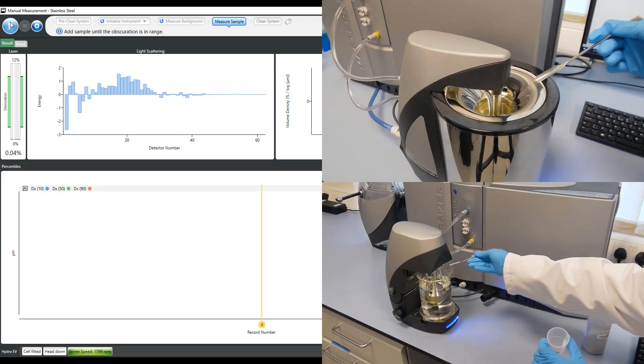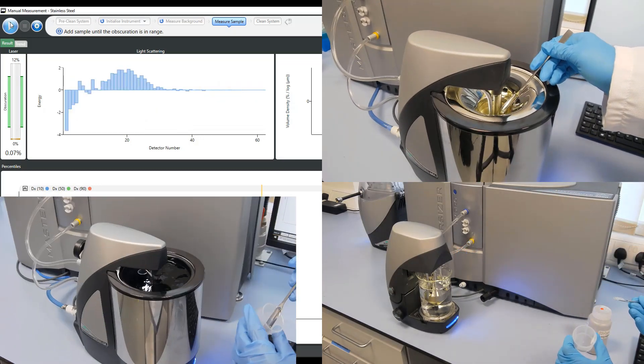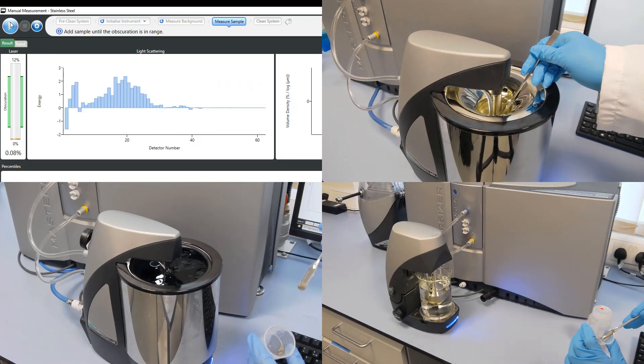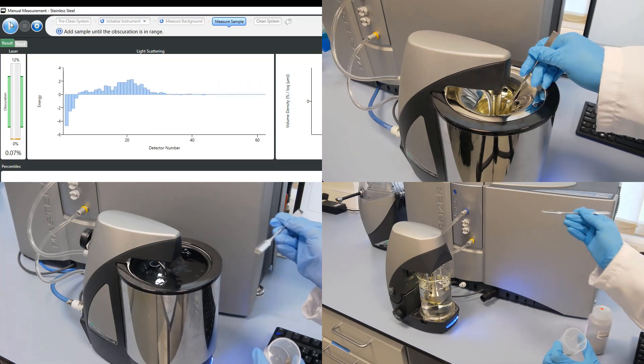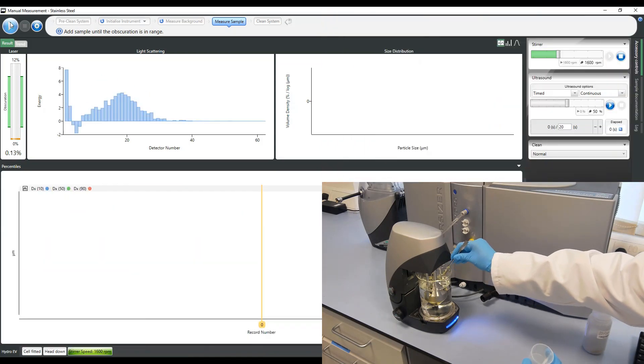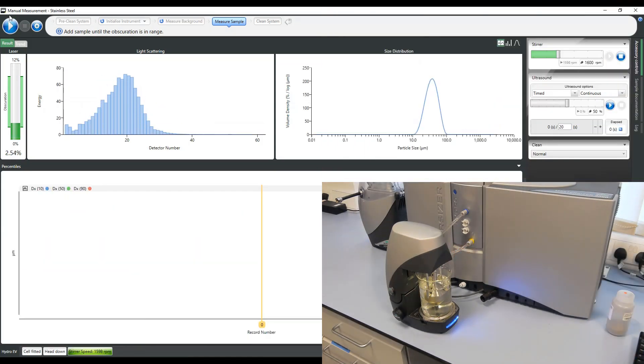The same method can be used for adding metal powders to the Hydro MV and Hydro LV. When the obscuration arrives within the defined range, the measurement can be started.